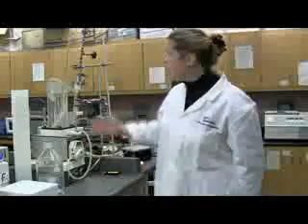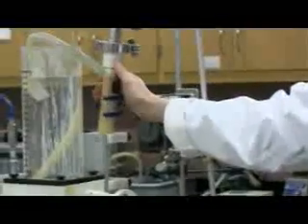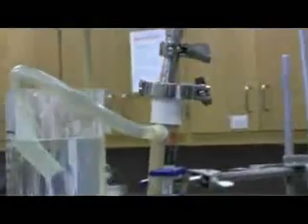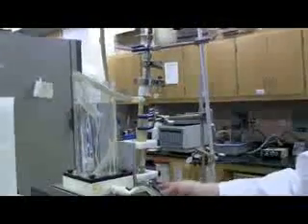So we have here a lovely ultrafiltration apparatus. This is a little bit jury-rigged. I know you're going to be critical of that, but in fact it works, and we are able to put in a nice hollow fiber membrane system. If you want to get a little closer to see the system, here we go. There it is. Okay, this is the hollow fiber membrane system.